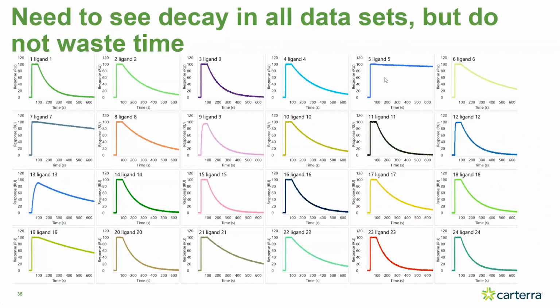Usually, I'd say characterization assays are run with between 10 and 20 minutes of dissociation. That is good enough to get you down close to the low 10⁻⁵ range in terms of observable dissociation. And very often, if you're not seeing dissociation in that phase, and you were to set it to, say, 35 minutes or 40 minutes or even an hour, it's unlikely that you would all of a sudden overcome that and get enough data.